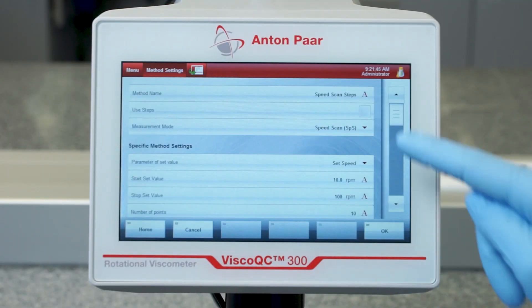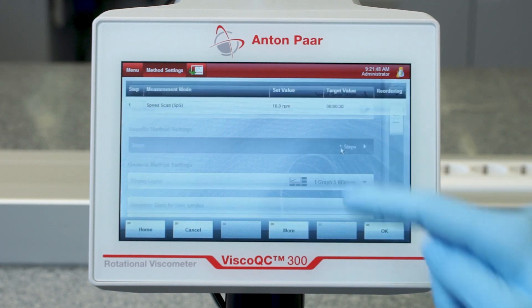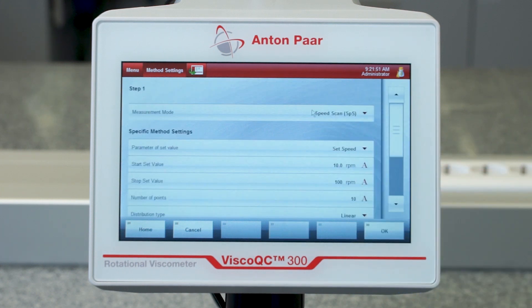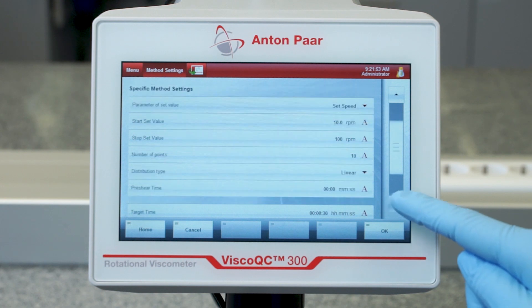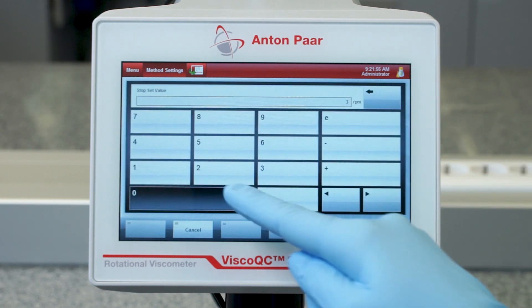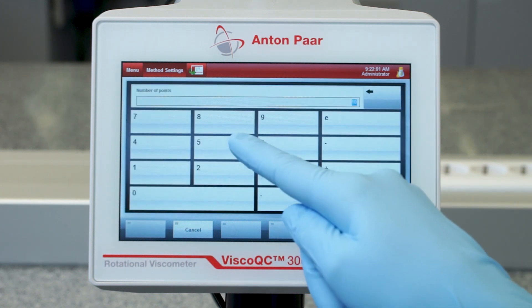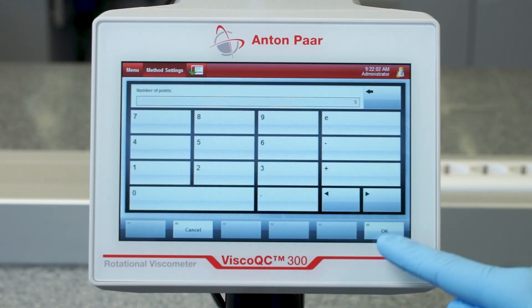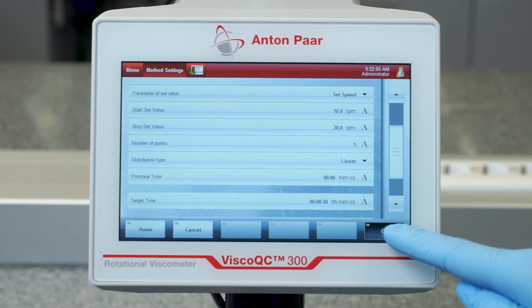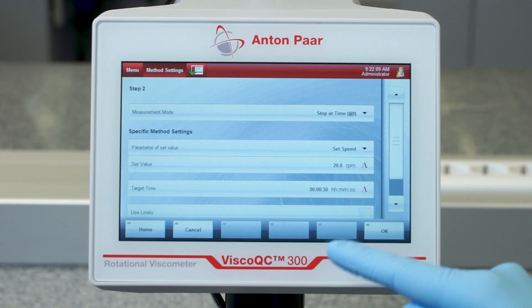Use Steps to program up to 50 steps. Within each step, you can define the mode that you want, and adapt mode-specific parameters according to your needs. Simply add a step by pressing More and New.